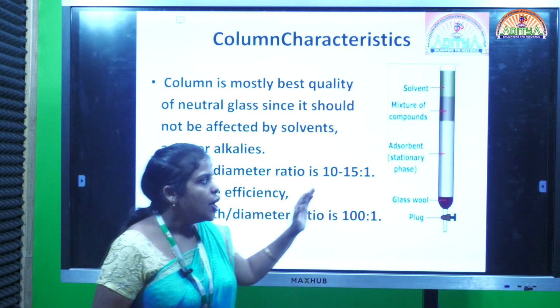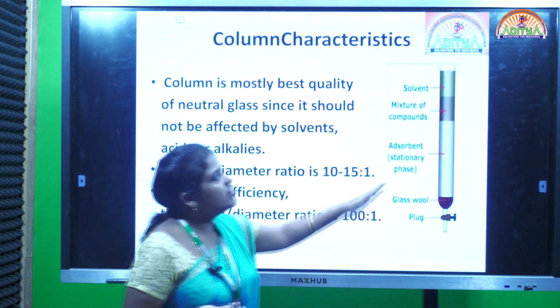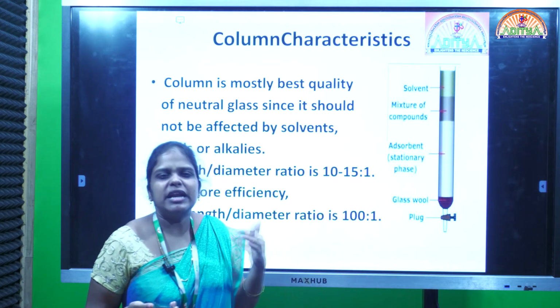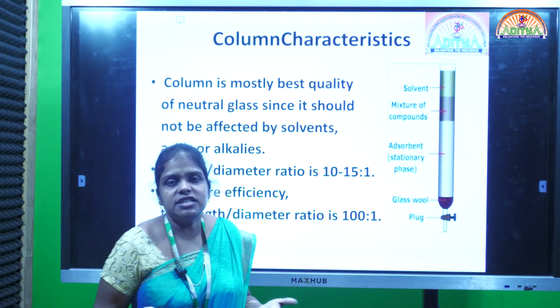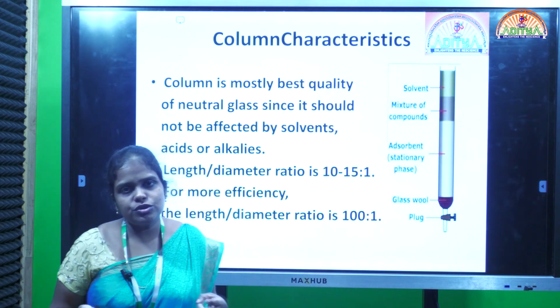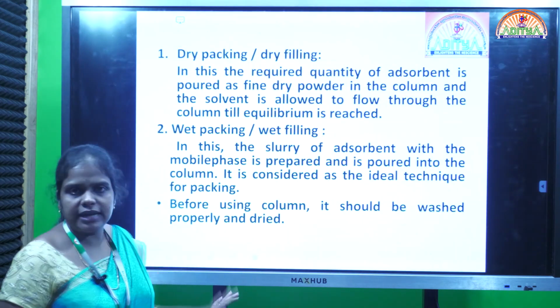But in wet filling you are already mixing that silica powder with the solvent, so it is already a little bit wet. Whenever we are adding the solvent in liquid form, there will be nice separation, there will be no formation of air bubbles or cracking, and no uneven distribution of the sample in the stationary phase. That's why among these two, wet filling is the most advanced and useful one compared to dry filling.